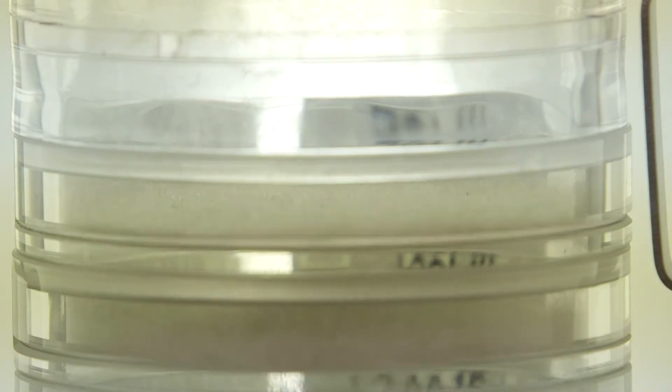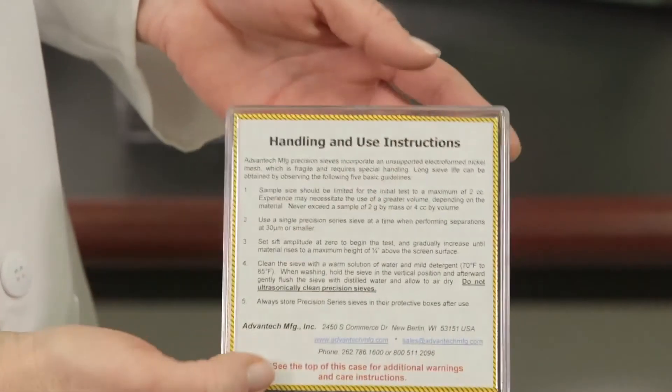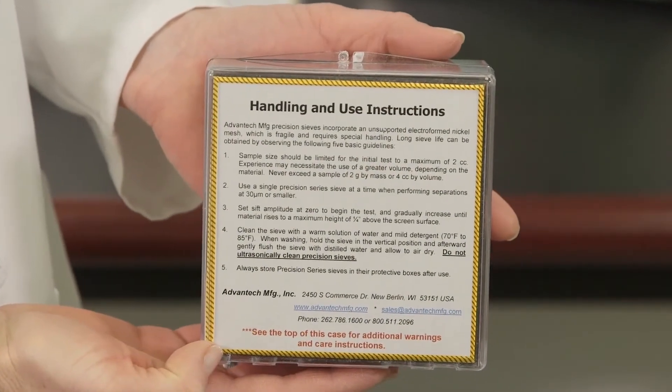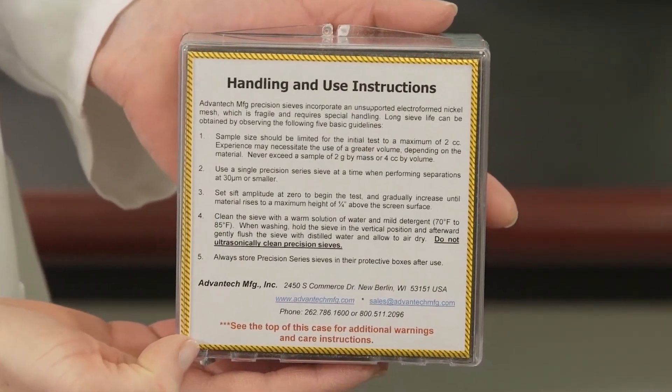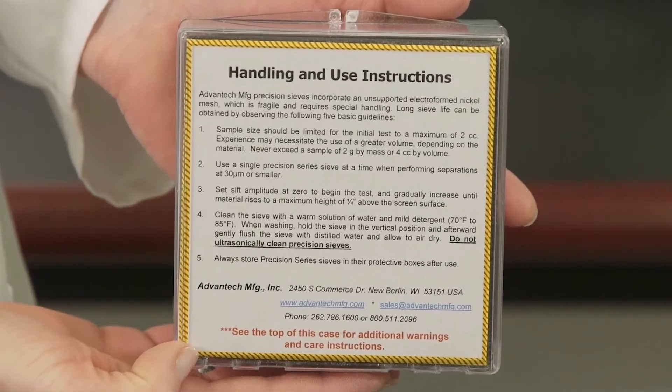Slowly increase the amplitude while observing your sample through the transparent sieve frames. The optimum amplitude has been reached when the largest particles are rolling on the sieve surface and no particles are arcing higher than half the height of the sieve frame.